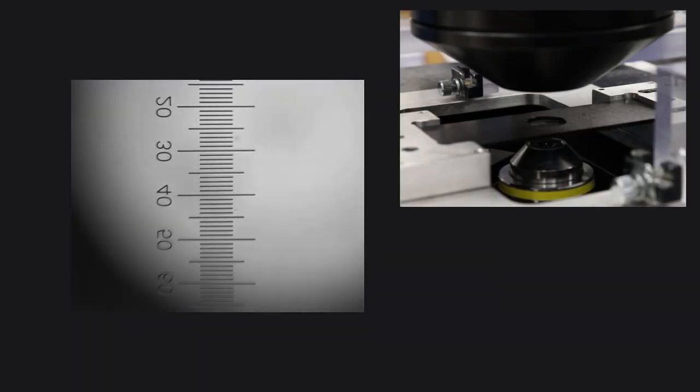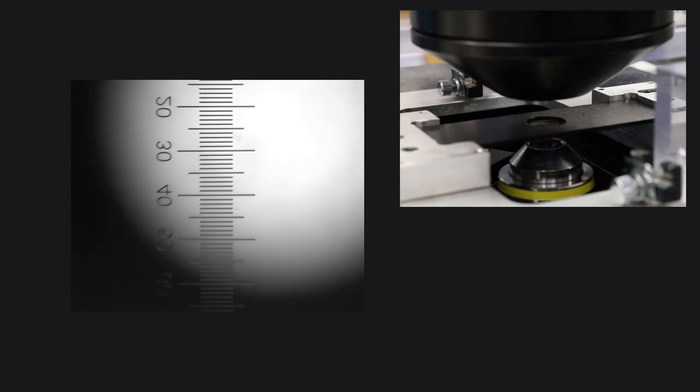Now we can start optimizing the illumination of the specimen by placing the condenser at the correct position, both vertically and laterally. The proper vertical position can be found with the help of the field stop. First I am closing the field aperture all the way. Then I lower the condenser until a more or less sharp image of the outline of this aperture is seen in the same plane as the specimen.